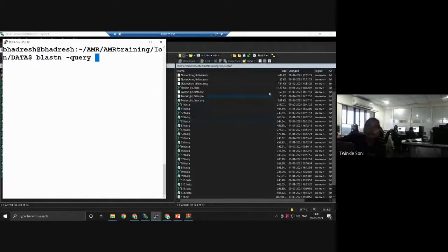You can choose any of your FASTA files. Like, just type over here, I'm going to choose S10.fasta. So I'm going to work with it. Choose any file out of these 12 files. Use tab. Please make sure that you use a FASTA file, not FASTQ files.